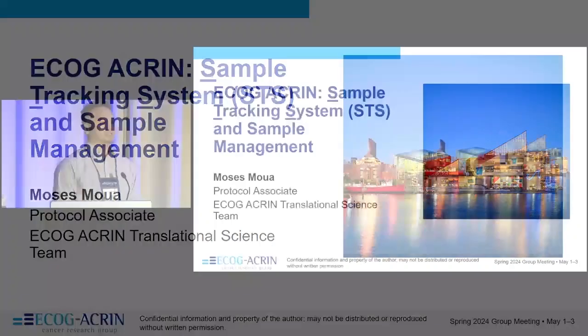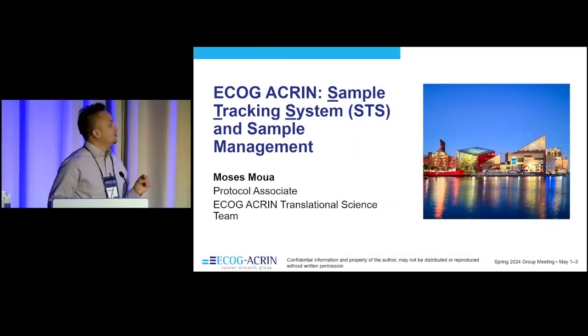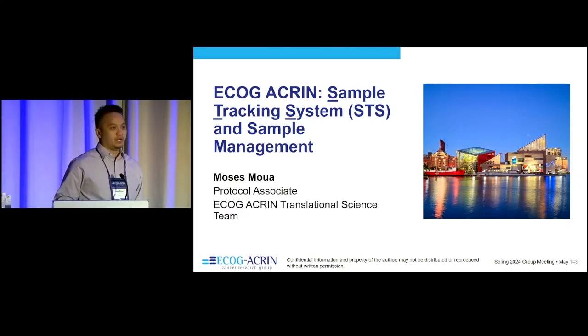I'm part of the translational science team at ECOG-ACRIN, and we'll be talking a little bit about the sample tracking system, which is ECOG's way of tracking all their samples, logging all the samples, and some of the sample management that we do as well.